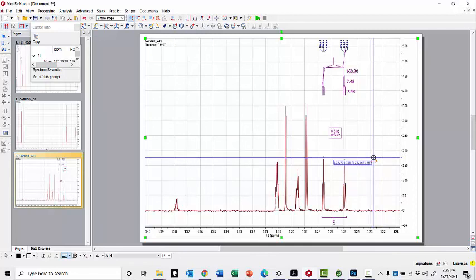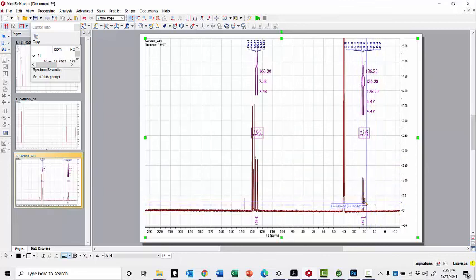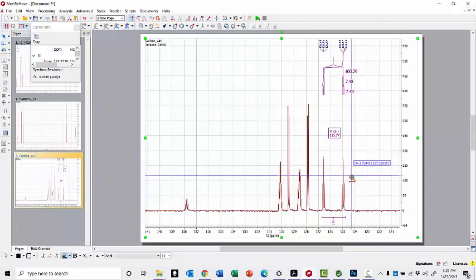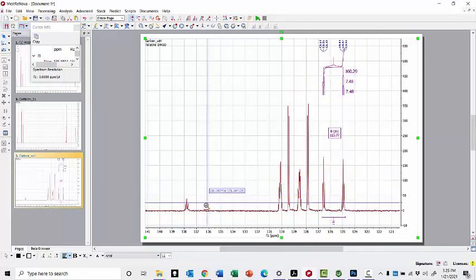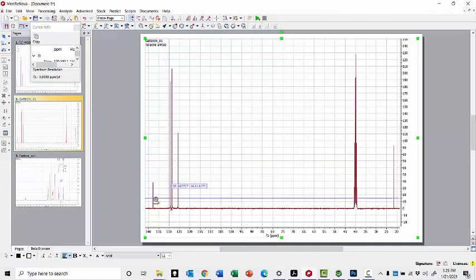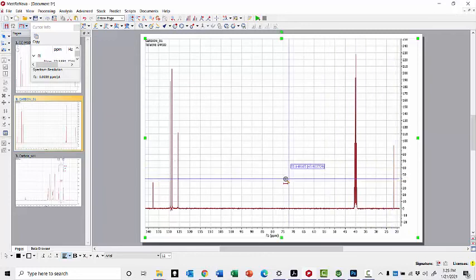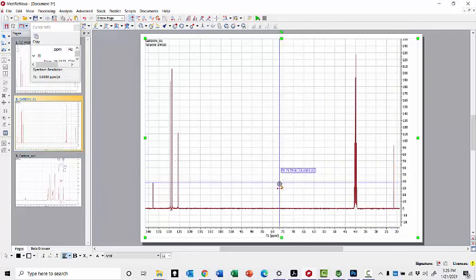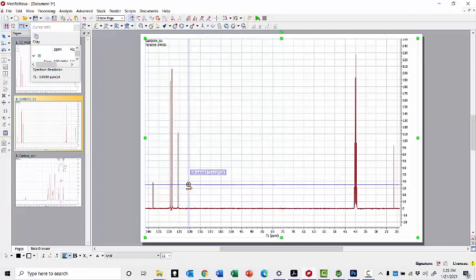At the first level of analysis, what I'd want you to be aware of is that the hydrogens will influence the carbons that they are bound to, but you quickly realize that things become more complicated in a hurry, because though we have a nice doublet and a nice doublet and a nice doublet, once you start looking closer than that, things get ugly in a hurry. So in practice, what do we do? We suppress all of the signals. What we end up with is singlet, singlet, singlet, singlet, singlet. And that's because usually what we care about is the chemical shift of the carbon and how many carbons are in those environments. And it's valuable to turn these into singlets for the purposes of analyzing things that way.